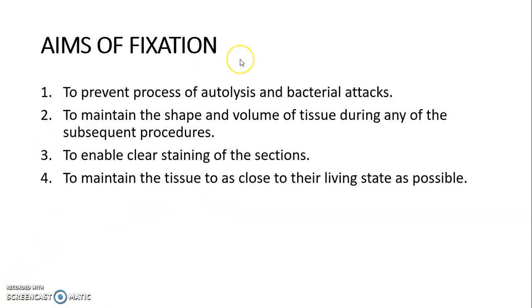Aims of fixation are to prevent the process of autolysis and bacterial attacks, to maintain the shape and volume of the tissue during any of the subsequent procedures, to enable clear staining of the sections, and to maintain the tissue as close to their living state as possible.